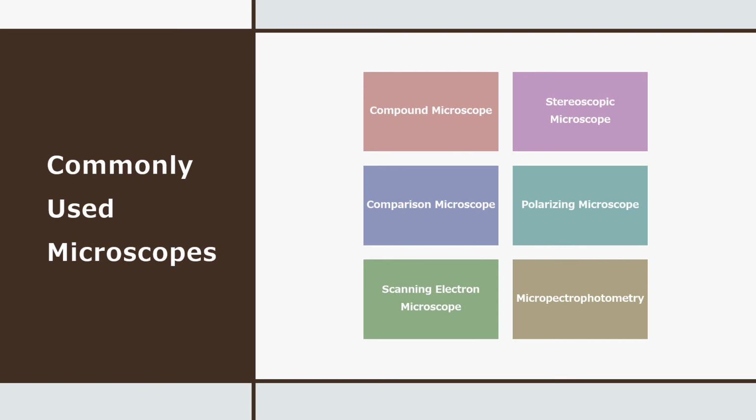Scanning electron microscope is a very sophisticated piece of equipment that you'll find mostly in extremely high level laboratories, like the FBI has one, but your local PD probably doesn't. You find it at major research universities. This can illuminate the structure of objects down to the atomic level. It requires a huge amount of training to do, and is not the type of thing that your average technician has ever even seen. They're outrageously expensive pieces of equipment and very, very tricky to handle, but extremely useful at determining the nature of certain extremely small particles.